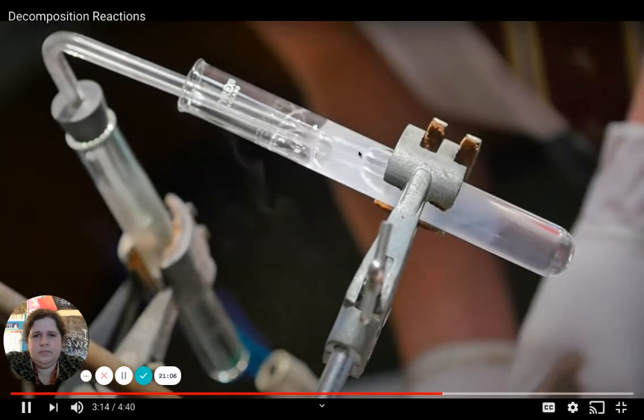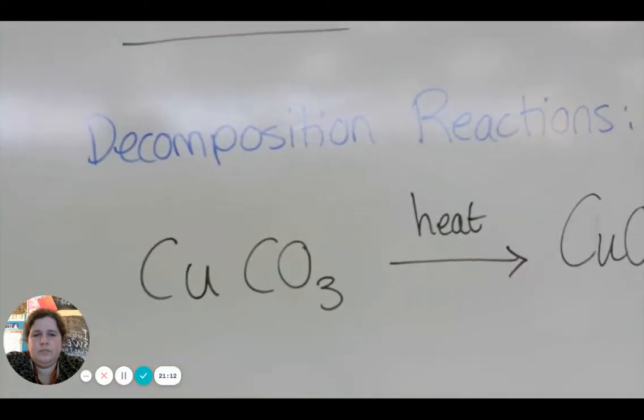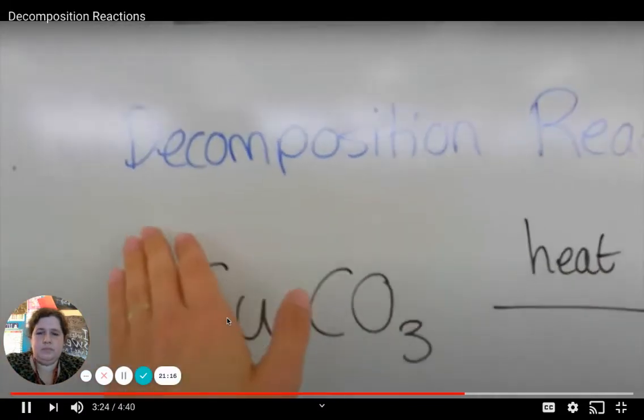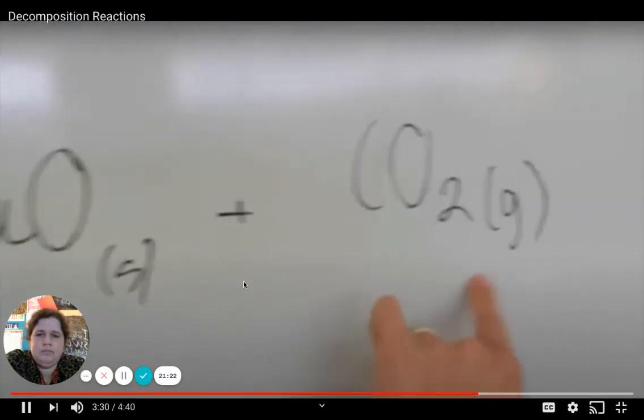And the other material that we created is CO2 gas, which is what we detected over here. The lime has reacted. Okay, so while the students are setting up their own experiments, let's talk about decomposition reactions. It's basically decomposing something. So we started with something relatively complicated. We break it into smaller parts.